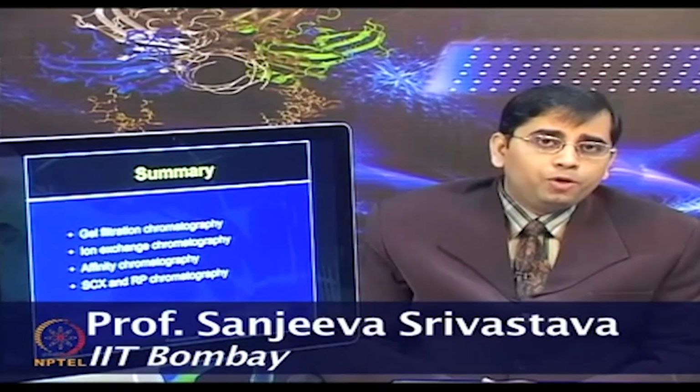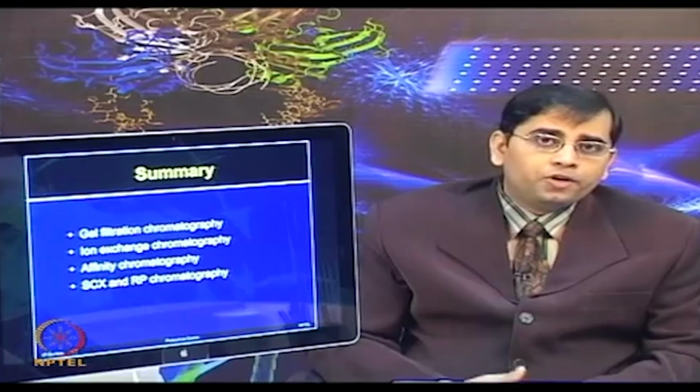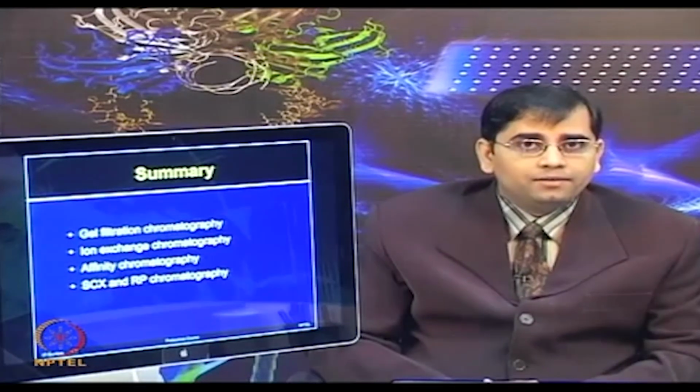So, in summary, we have talked about the principles of different types of chromatography methods commonly employed for proteins and peptides, and we looked at some of these chromatographic methods in more detail.